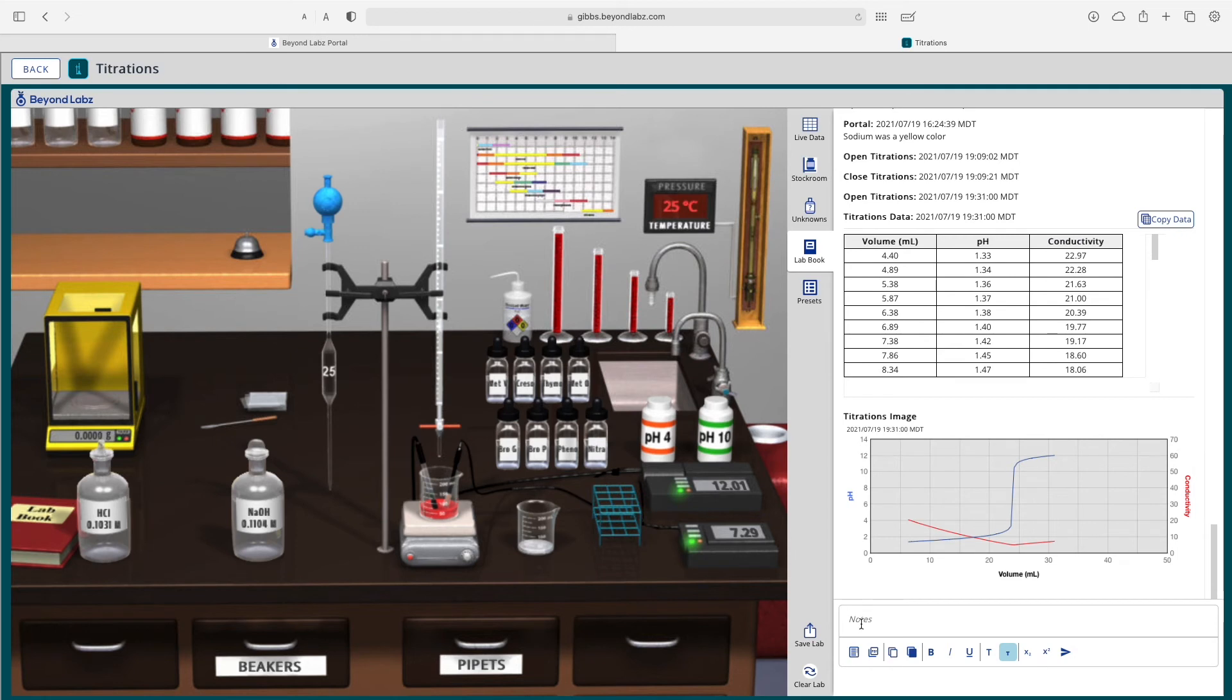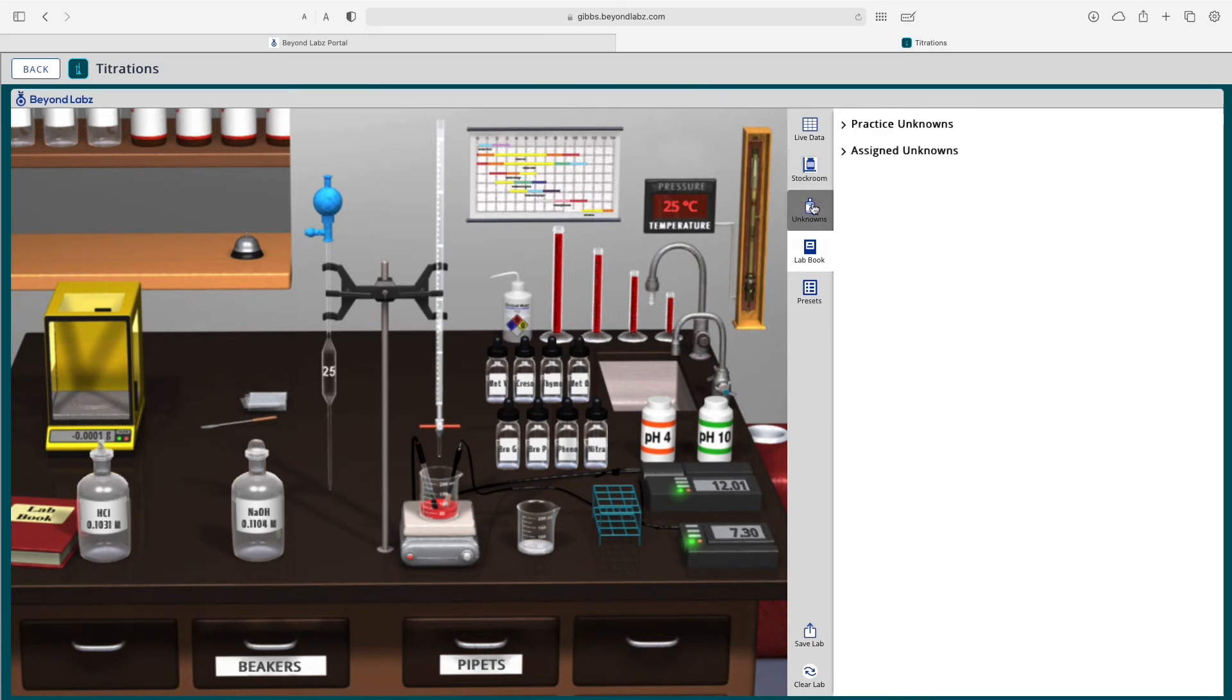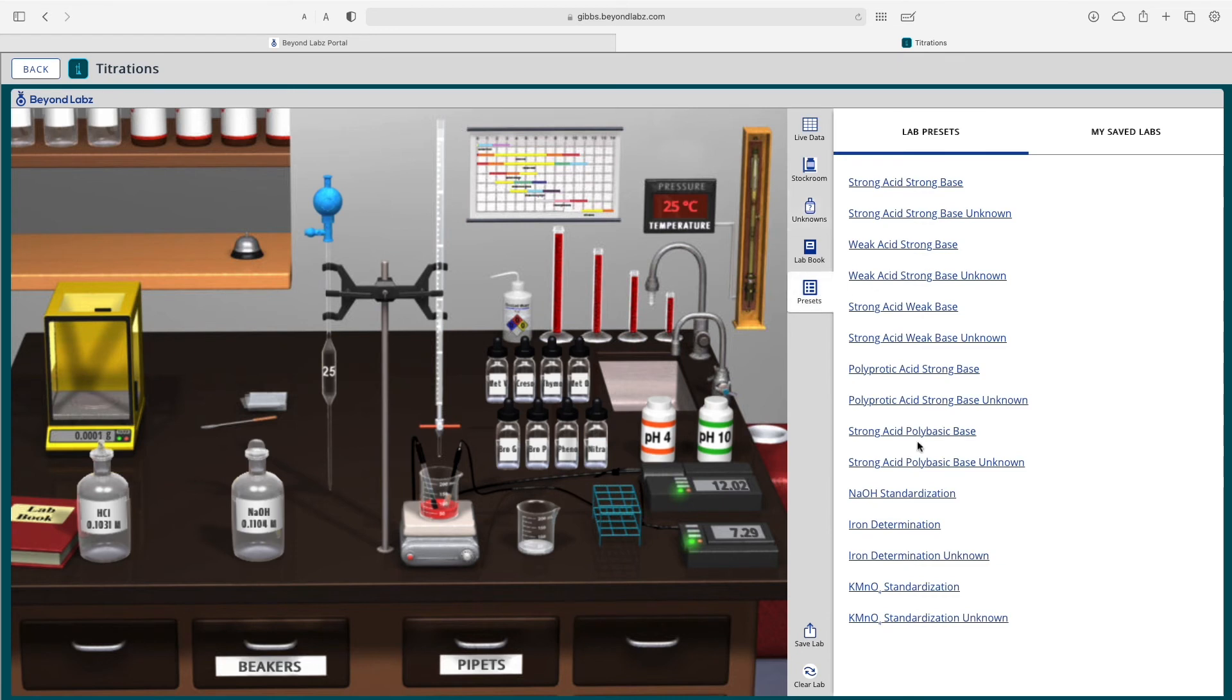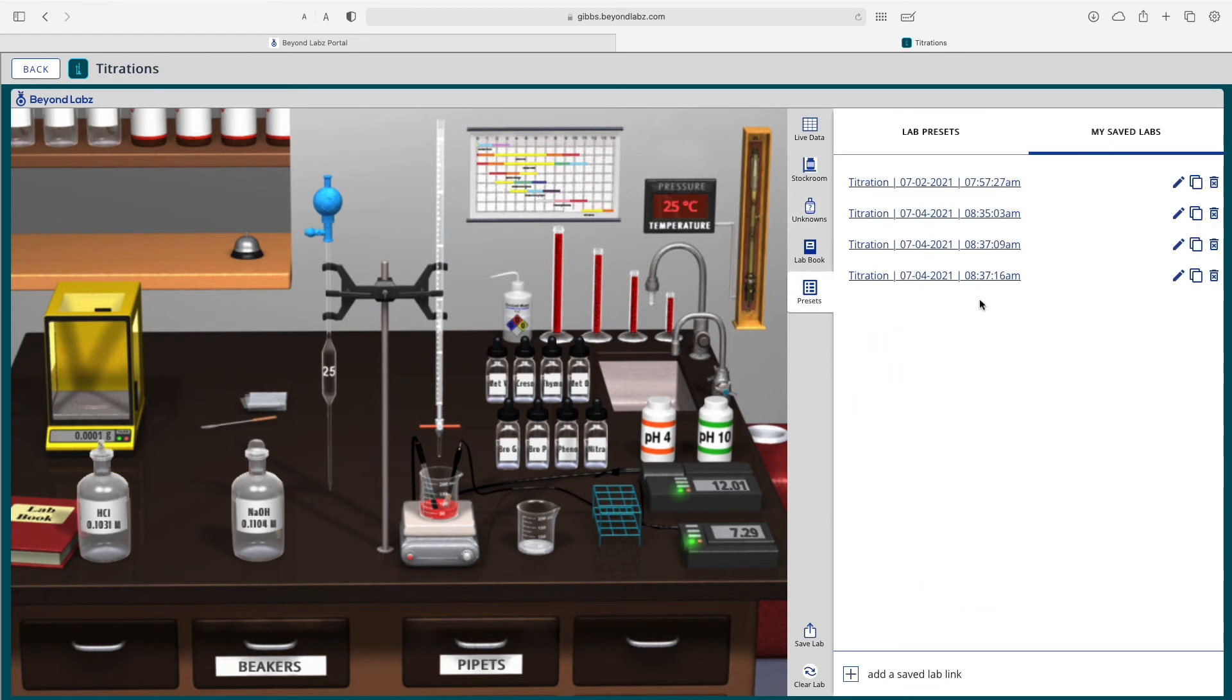We could add notes here if we would like and there also is a place to create your own practice unknowns if you would like or if you've been given an assigned unknown those will show up here.